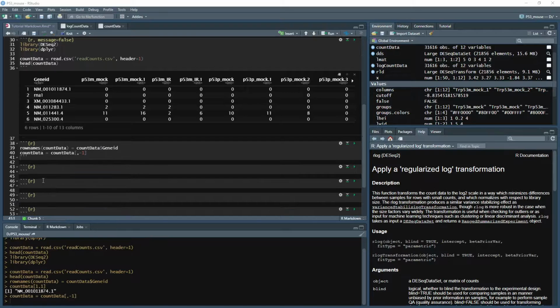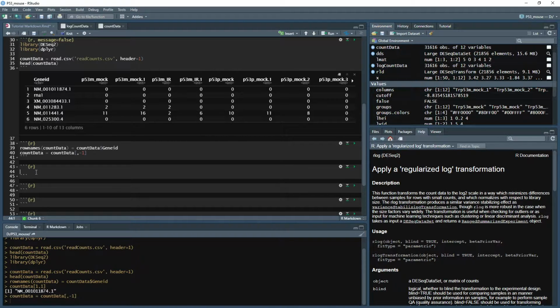All right. Now to make downstream processing of the data a little bit easier to do, we can parse out names. Here, when we renamed them in Excel, we just gave them their group name. So in this case, we just gave it p53- and then mock for the first 2. But R knows that you can't have 2 columns with the same name, so it puts a 1 at the end of it. Let's rename them. That way we have the group and then the replication all together.